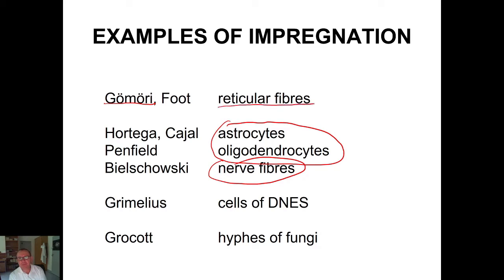These are special fibers of connective tissue. Then there are several neurological stainings, neuropathological stainings for glial cells or neurons.